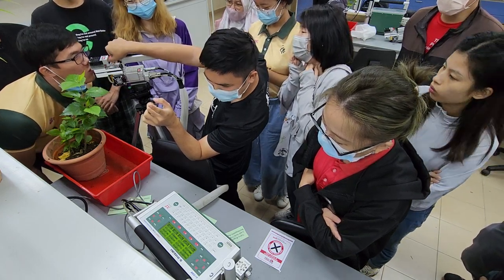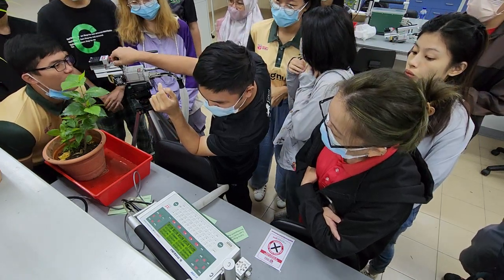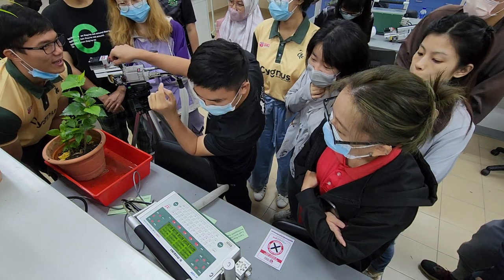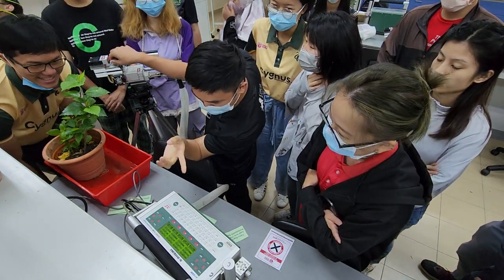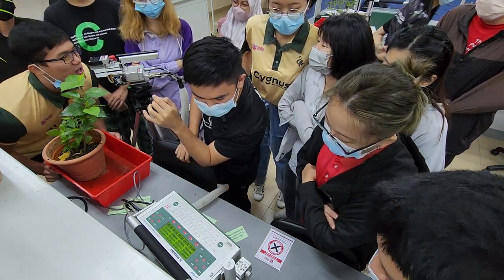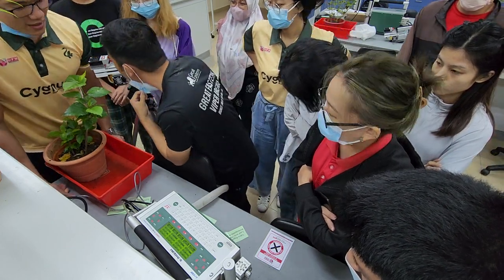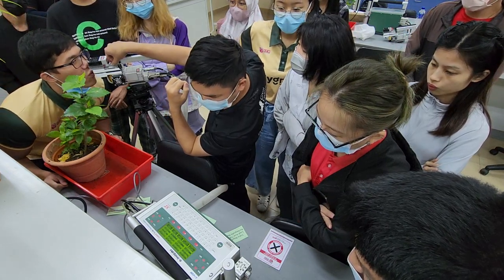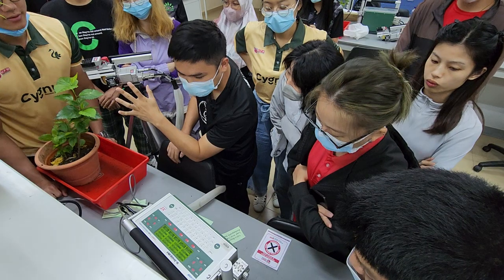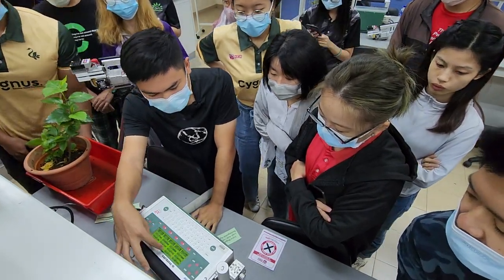Still increasing. No, not increasing already, right? Increasing but very slow, so you need to tighten it up again. This is not increasing anymore. See? So it means it is already tightened up. Okay. Double check. Okay. So next, it is stable already, right?